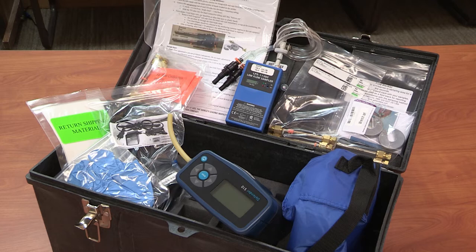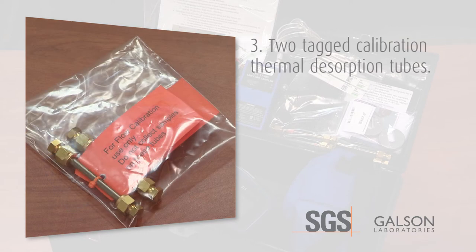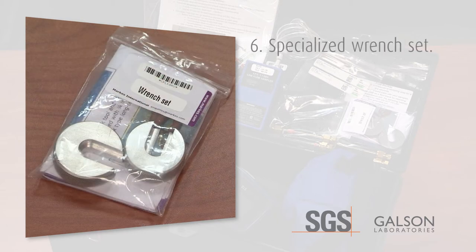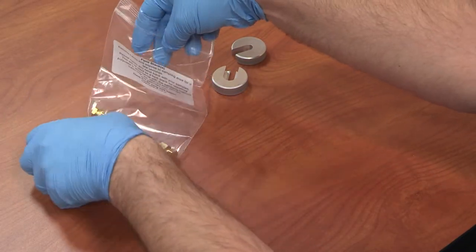Verify you have received everything you ordered. You should have received: one low flow air sampling pump, two dual split tubing for each pump, three two tagged calibration thermal desorption tubes, four two thermal desorption tubes for field blanks, five one pair of thermal desorption tubes for each pump, six a specialized wrench set, and seven an optional dry cal calibrator if ordered.